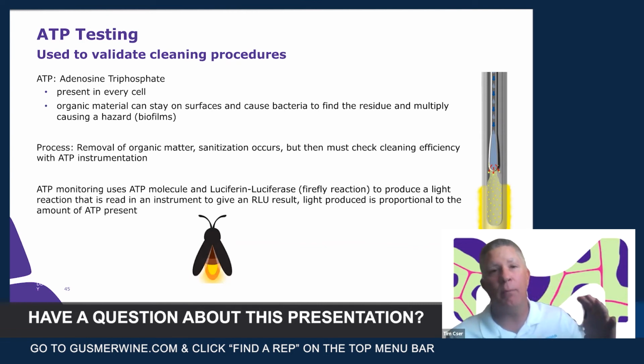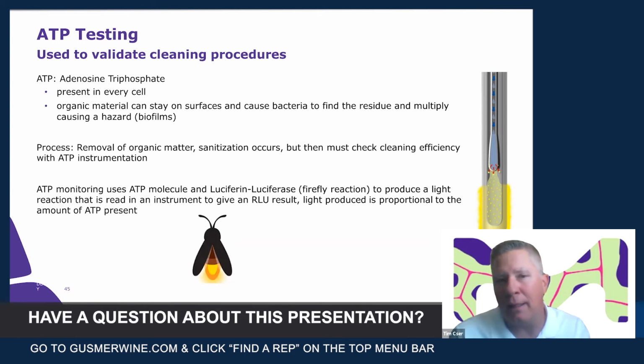That's why if we clean away our wine and we clean away our other grape debris and we think we did a good job, we're measuring total cleanliness. That's really all it's measuring, and you're kind of validating your cleaning procedure. But you should know it is possible that bugs can be on that surface that will not show up in ATP, because it's not that sensitive. It is sensitive, it's just not sensitive enough to detect sterility. Next slide.